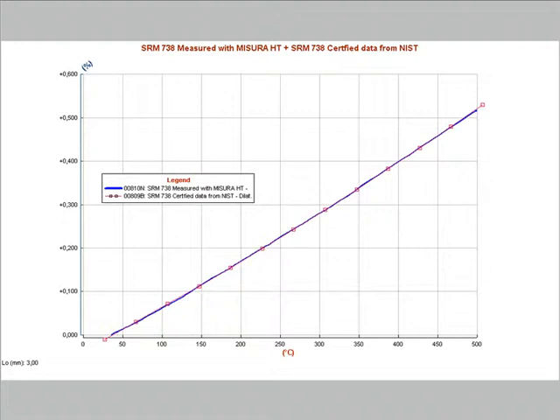In the optical dilatometer, the sample is completely free and it is not necessary to record and use the procedure of the calibration curve.